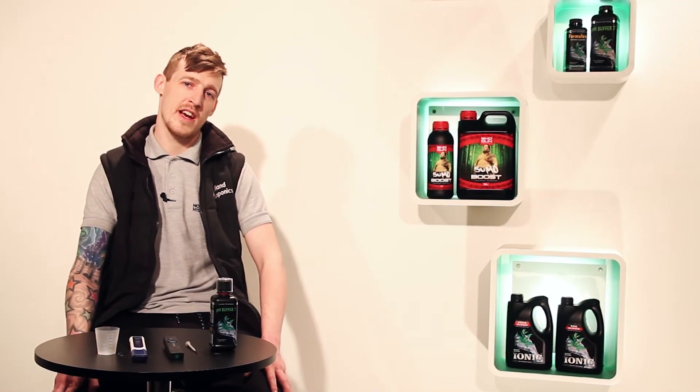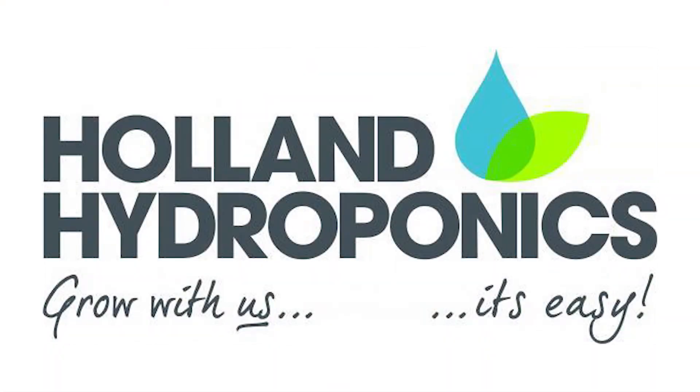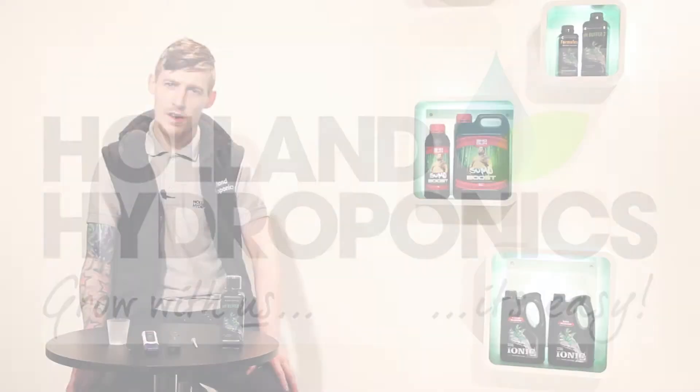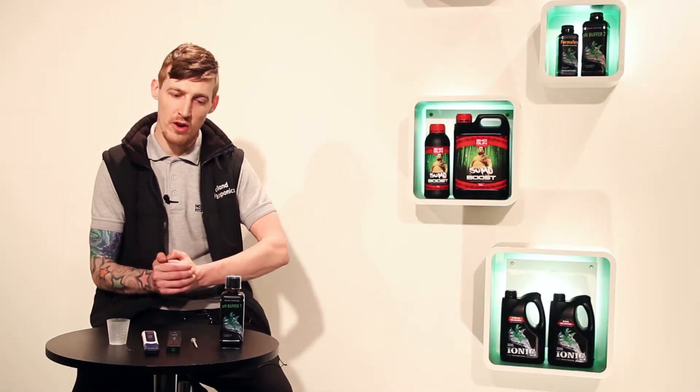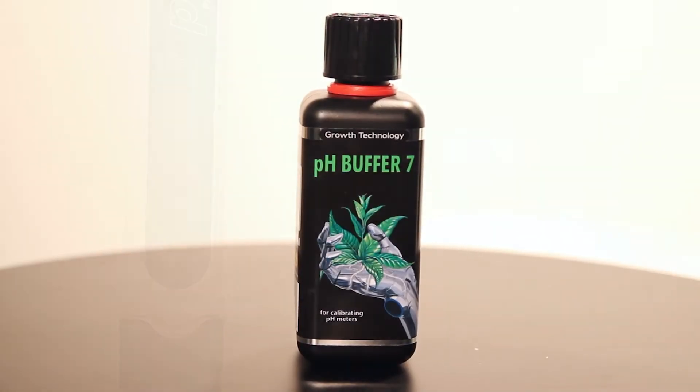Hello, my name's Dan. I work for Holland Hydroponics and today I'm going to show you how to calibrate a pH pen. Some of the basic tools you're going to need to get going are a buffer 7 solution, a good choice of pH pen, and a measuring cup.